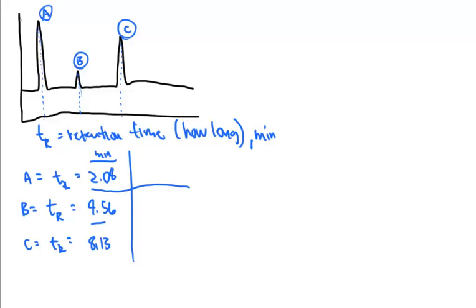Another piece of this table down here below, and you've got to be careful, because sometimes it gives you all kinds of info down here at the very bottom. We don't care about any of that other information. Whatever is listed down there, who cares about it? We just need to focus on area. That's it. Not area percent, not height percent, but full-blown, straight-out area. That's all that we need. And there's going to be a number down there at the very bottom.